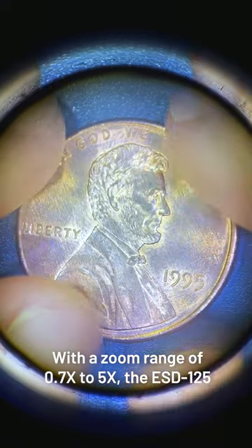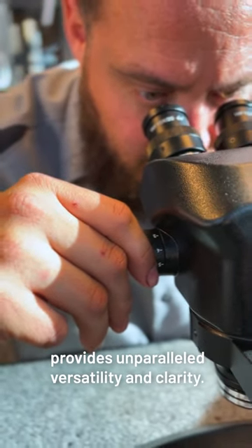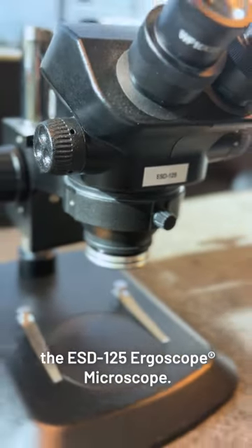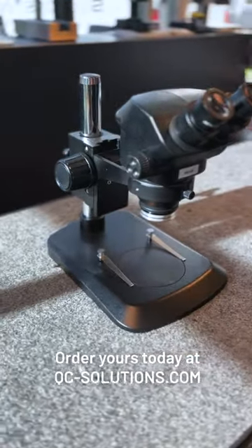With a zoom range of 0.7 to 5x, the ESD125 provides unparalleled versatility and clarity. Experience the power of precision with the ESD125 ErgoScope Microscope. Order yours today at qc-solutions.com.